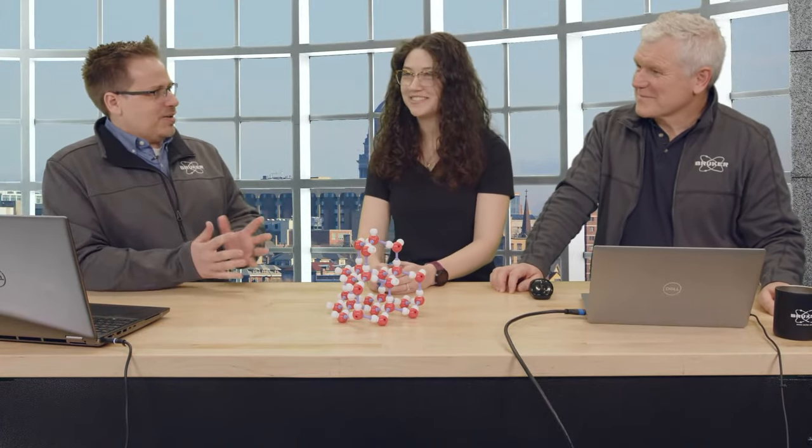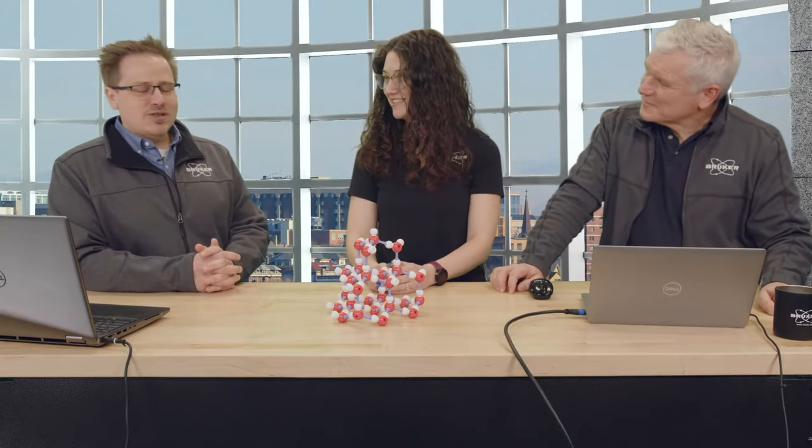Good morning and welcome. Good morning. Thanks for having us. So today we're joined by Ashley and Michael from our single crystal group. So now, modulated structures. Why? Like, what makes a modulated structure different than a normal structure?